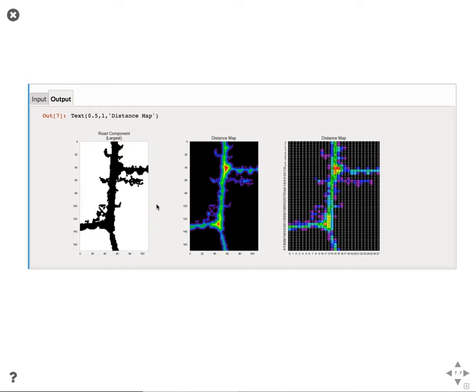And so the skeleton, as we define it here, is the thinnest representation we can have of the object that we're looking at. We want every point where it's a straight line to be 1 pixel long or wide, and everything that's a branch would want to be 3 pixels. So the idea is to thin away everything that's superfluous, that's not telling us about the specifics of the structure that we're interested in.